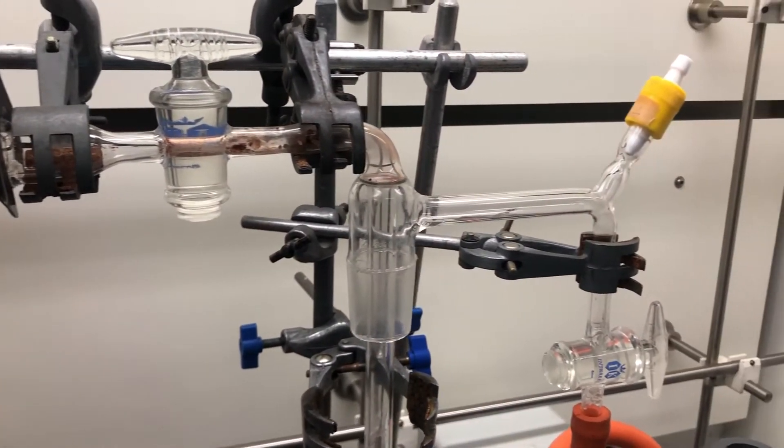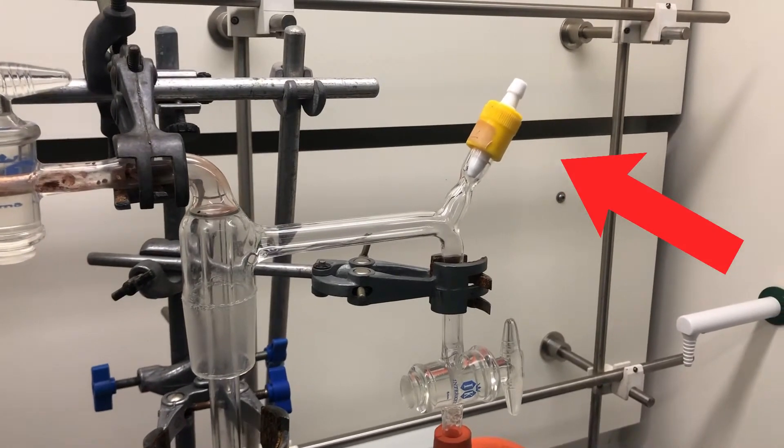You can see here as well that we have an air bleed, which is what we closed last to put our line under vacuum.